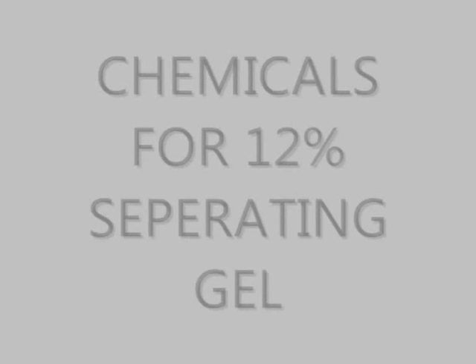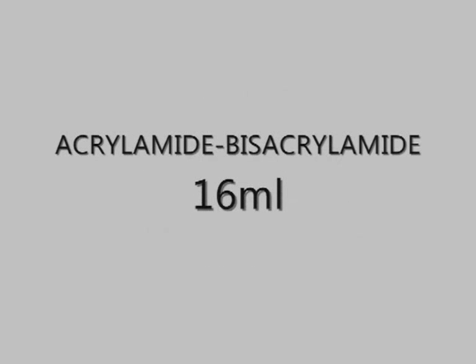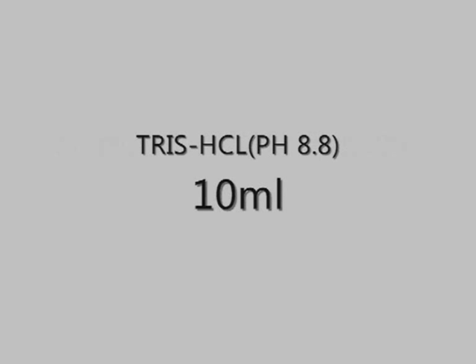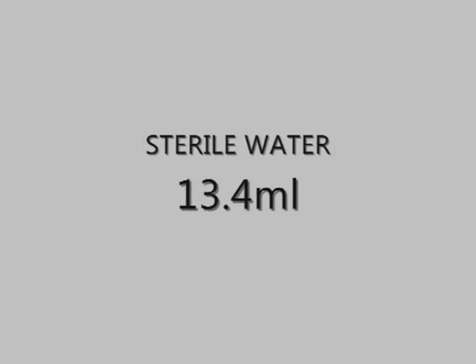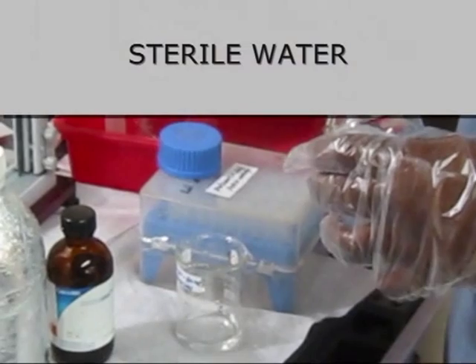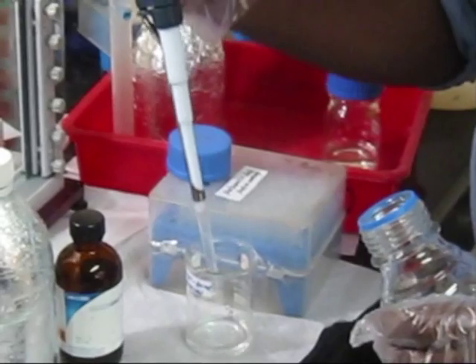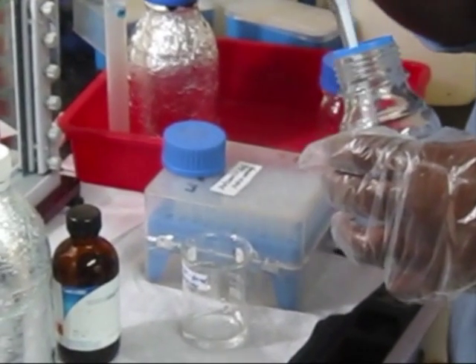Chemicals for 12% separating gel: acrylamide bisacrylamide 16 ml, Tris-HCl at pH 8.8 at 10 ml, sterile water 13.4 ml, ammonium persulfate 250 microlitres, 10% sodium dodecyl sulfate 400 microlitres, and TEMED 35 microlitres. Sterile water is being added; it should be devoid of any contaminants which may interfere with the flow of proteins through the gel.